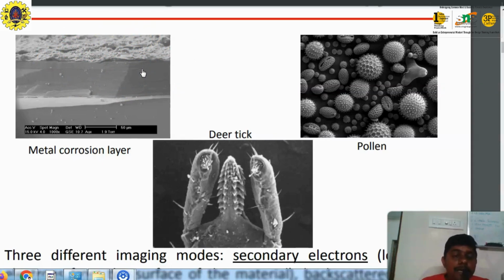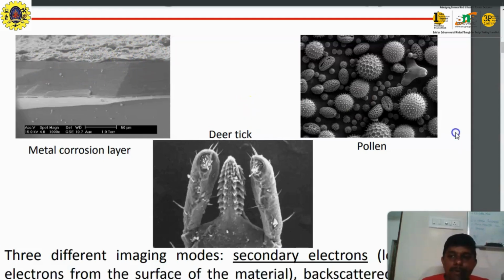When we make a sample by casting, we have to analyze which metal matrices have been mixed in that particular sample. When the electron beam strikes the surface, it can trace out the topography of this image.